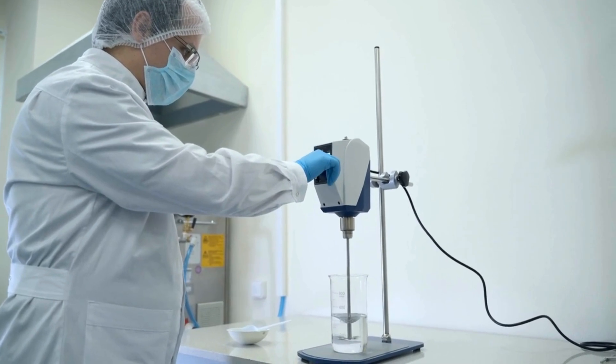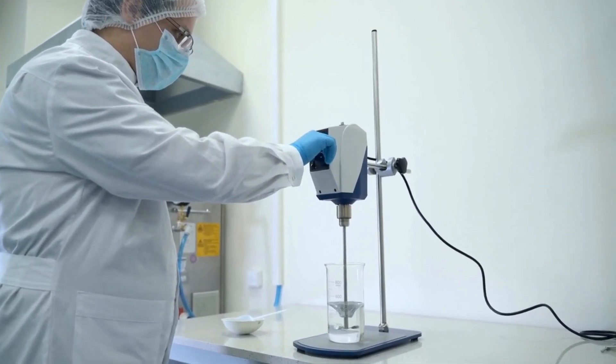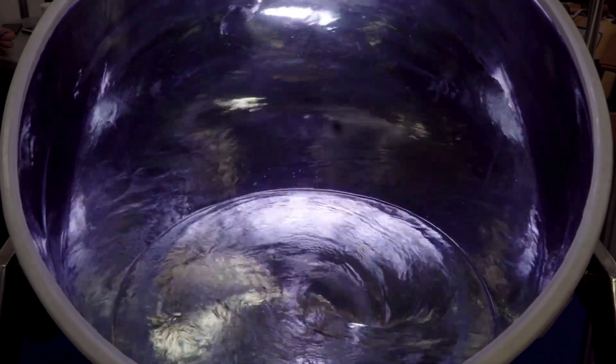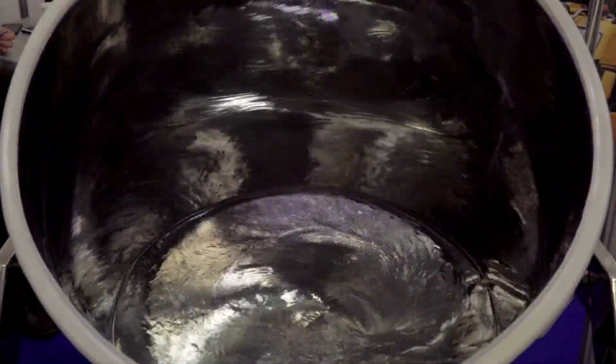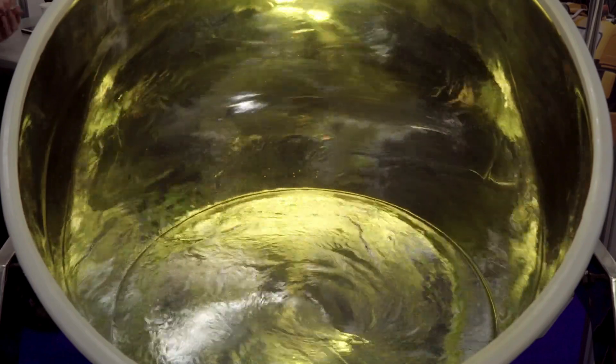Reason three. Safety first. Mixing volatile chemicals. A closed container on a stirrer reduces spills and exposure. No more waving a glass rod around like a mad wizard.